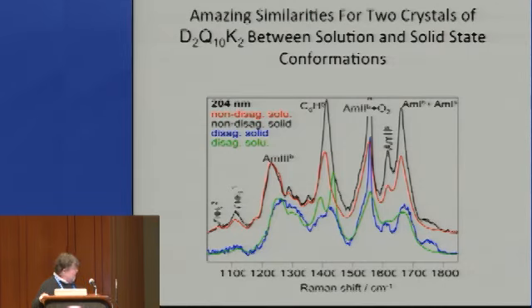On the other hand, we can make a different type of solution where the Raman spectra are completely different in solution. It looks like an extended structure. And it's, in fact, a 2.51 helix PP2 equilibrium. Both the solution and solid state have similar conformations, and these are interconvertible. They're not interconvertible between them unless you heat them. They're stable for about a week.